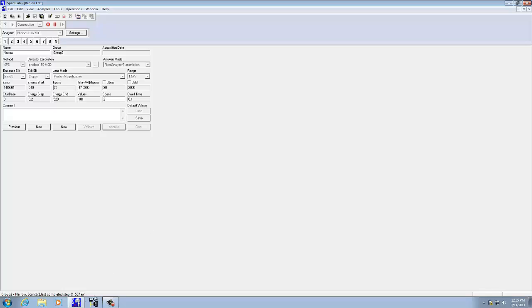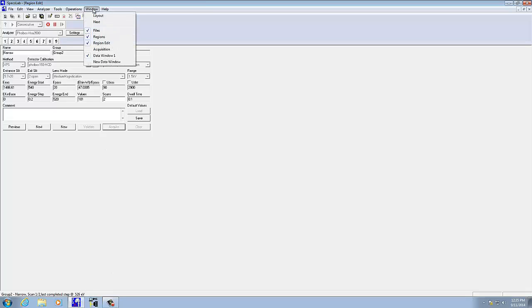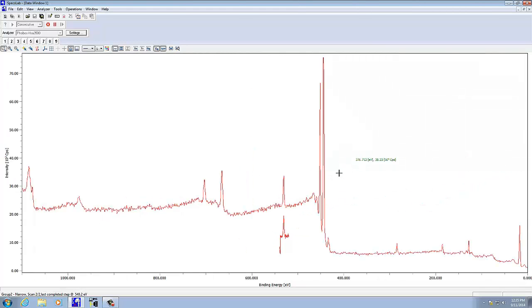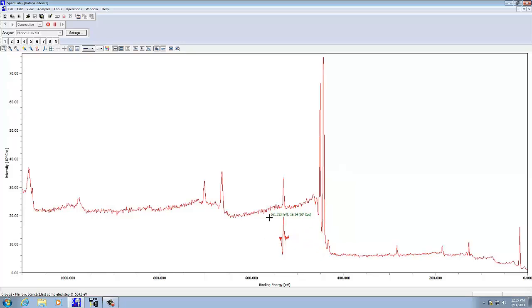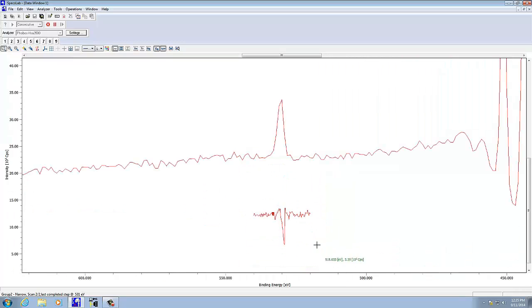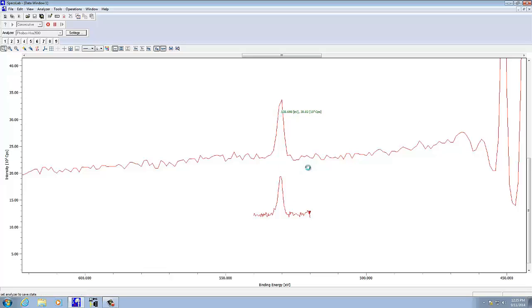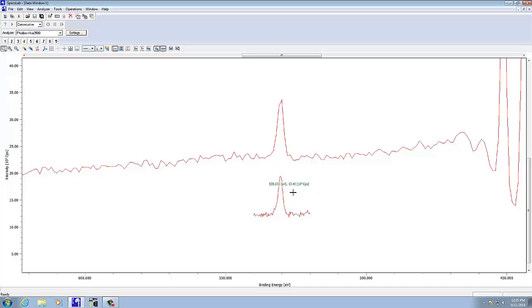If we watch down here, we can see it's scanning, but right now I have the data window hidden behind. If I now bring the data window back up, we can see it's actually down here. I'm going to double-click, and we can now see it's doing a narrow scan here, change the pass energy, change the step size, so we get more detail here. Notice that the intensity went down because I went from 30 EV pass energy to a 20 EV pass energy.